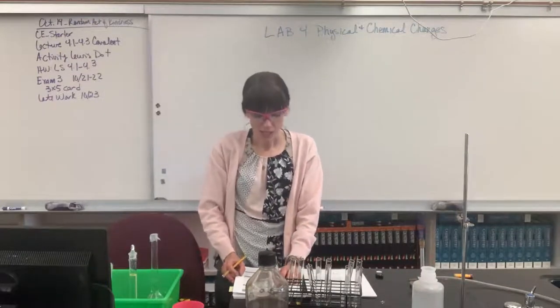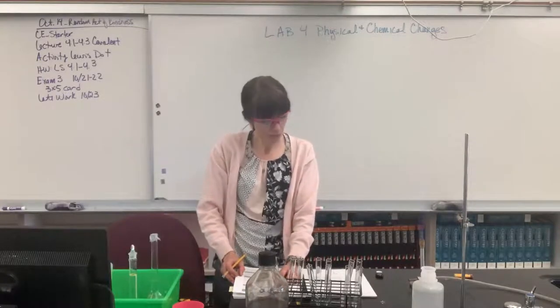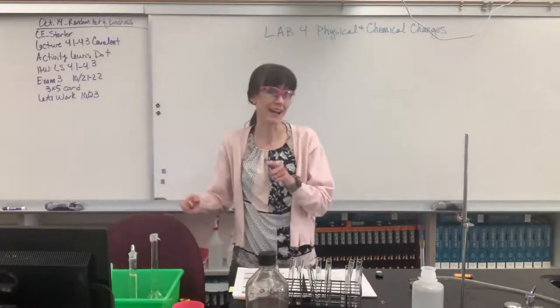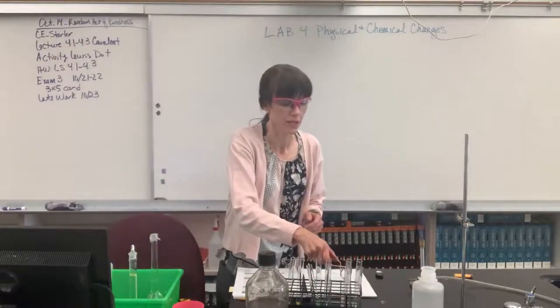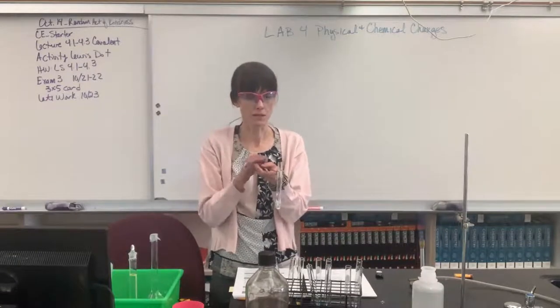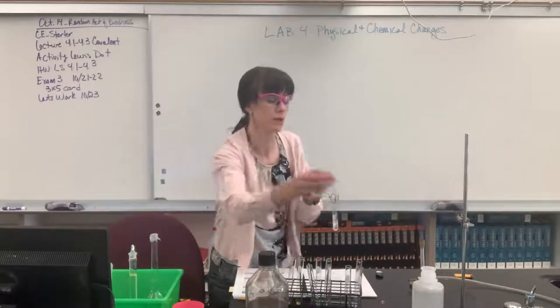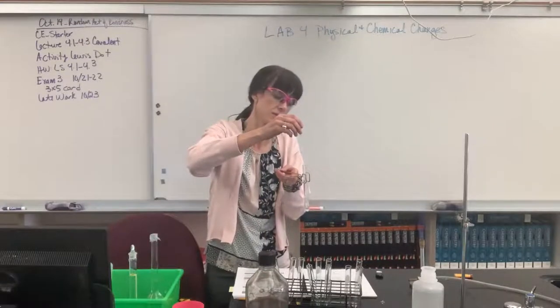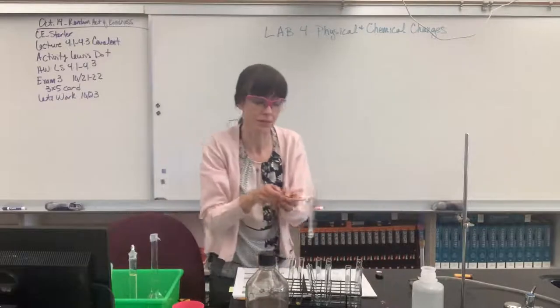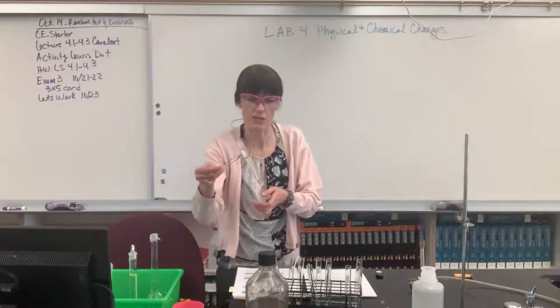Now it says number eight. Test the remainder of the recovered solid in the test tube by following the directions given on step four. So on step four, we had to add the water and then we added the silver nitrate. Now I'm still going to use my test tube holder because that glass is still going to be hot. Let's go ahead and add 20 drops of water. Had a little squirt there. Okay, that's going to be 20 drops. I'm going to swirl that around. Still have kind of some up on the edge there.